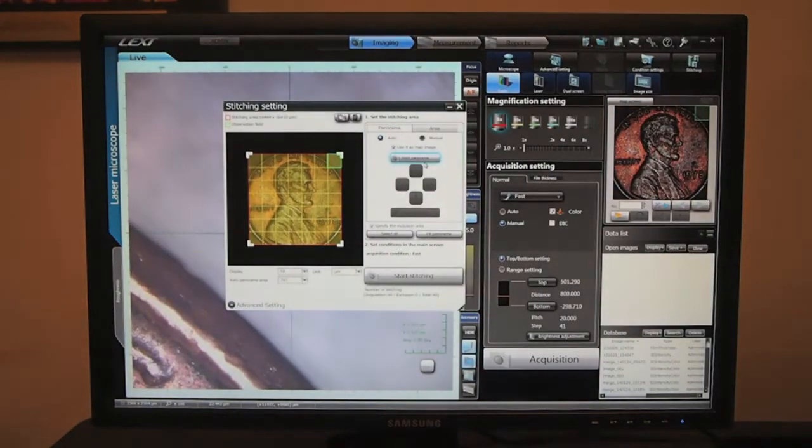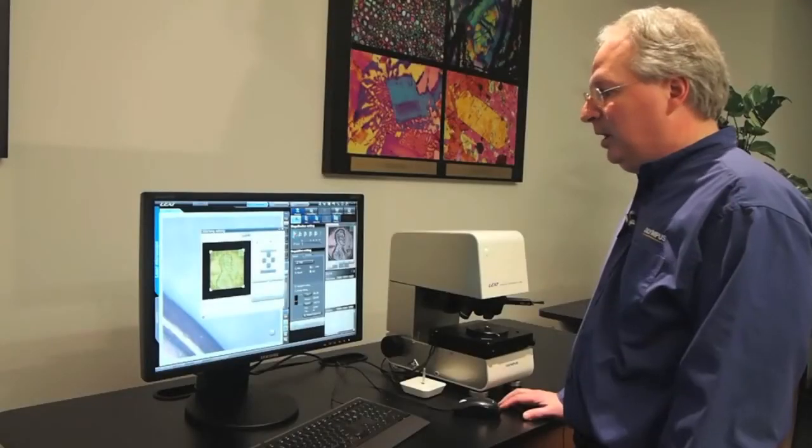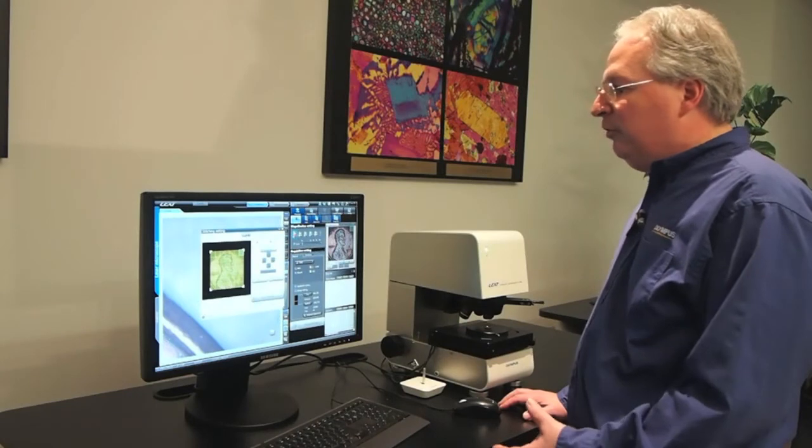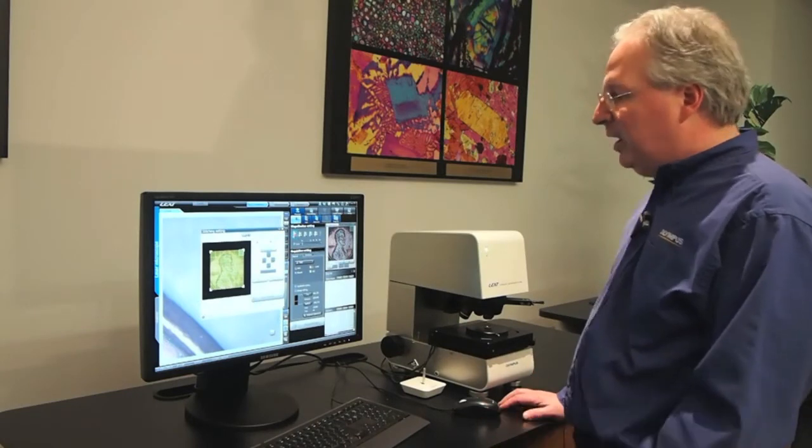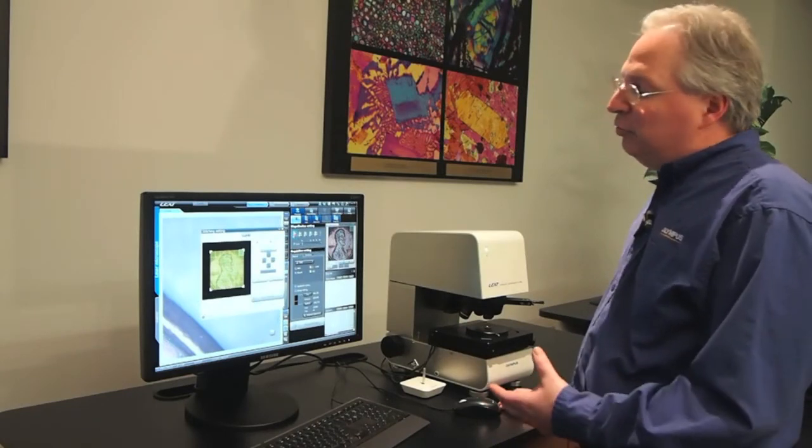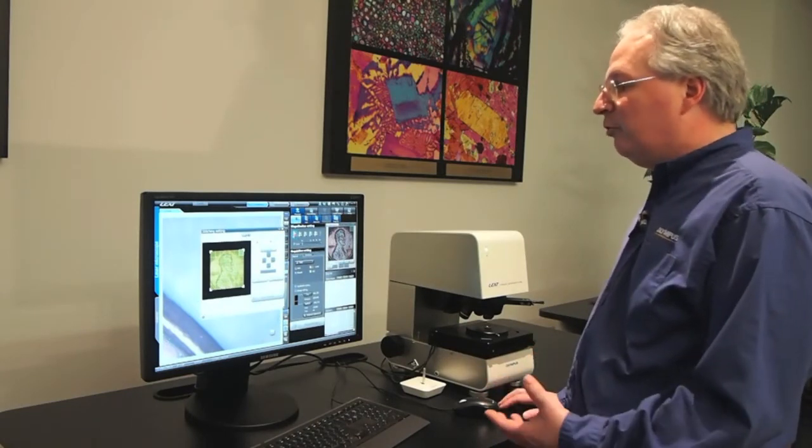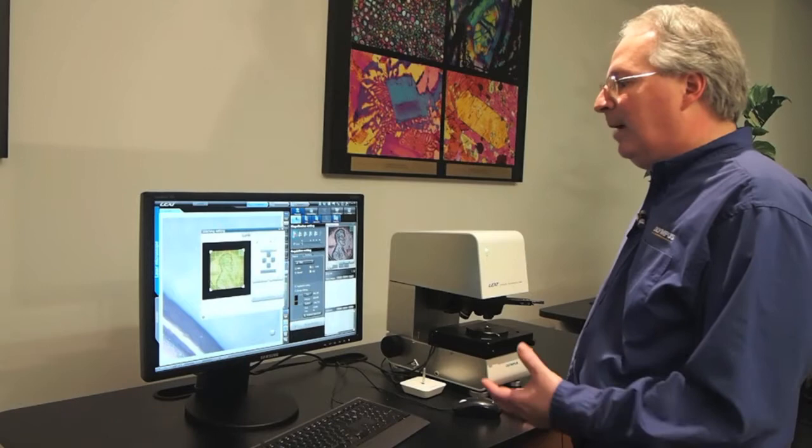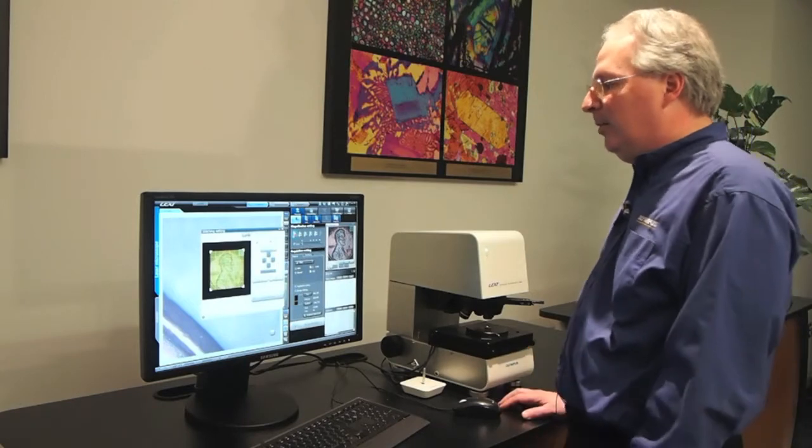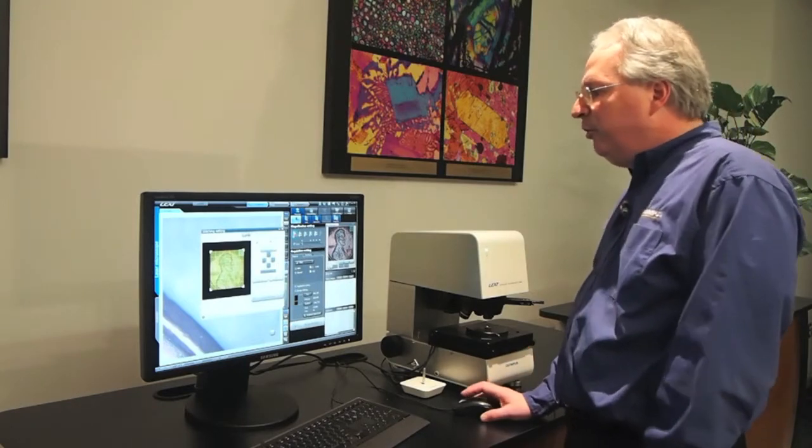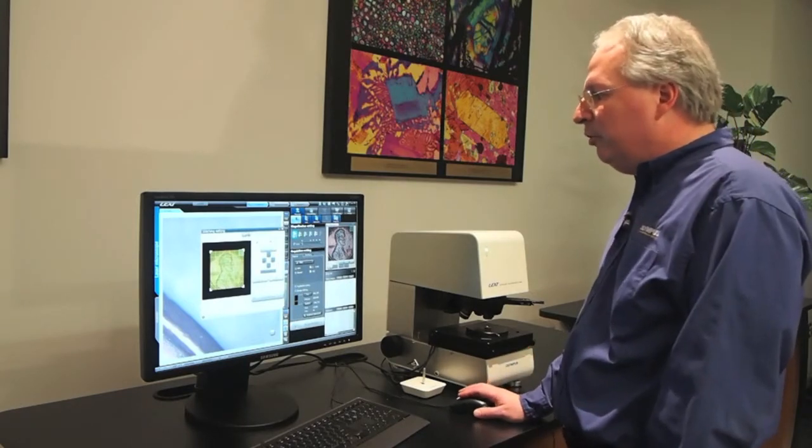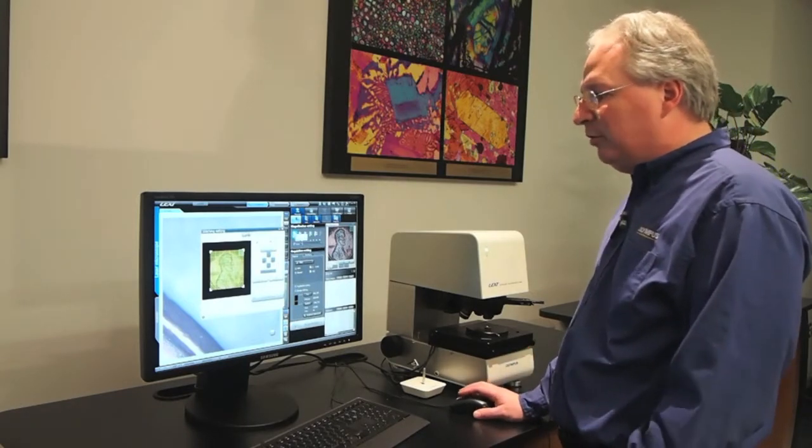Now that we've completed that initial scan of our penny, we can see it took about 20 to 30 frames to capture this entire image, but we're still at our low resolution 5x objective.